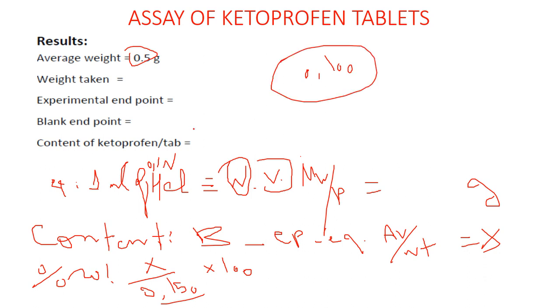Okay, so you are going to add 20 milliliter of sodium hydroxide.